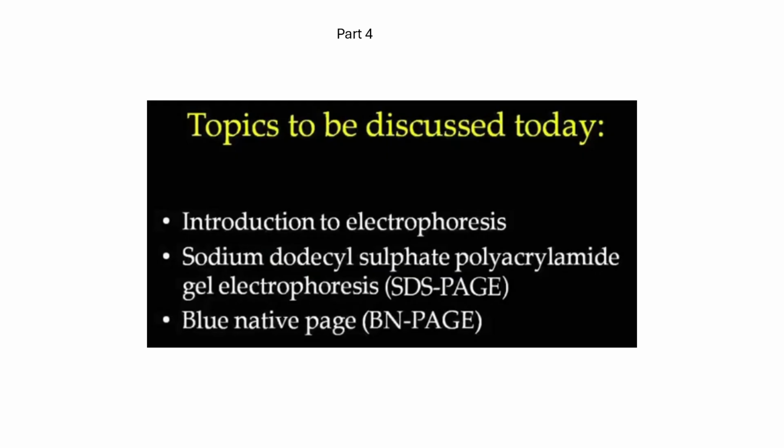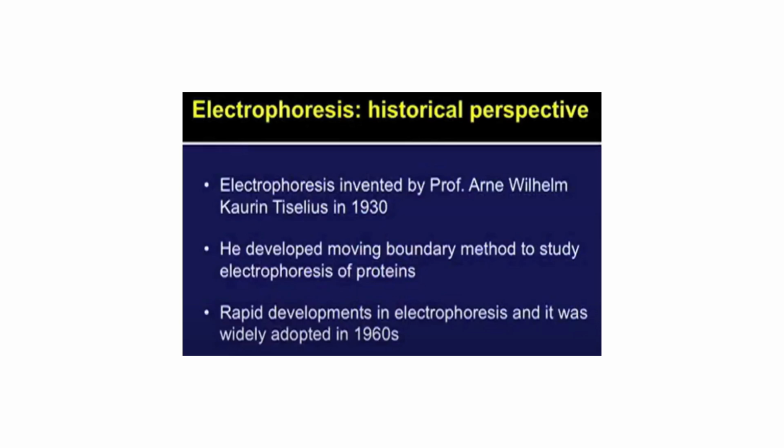Then you cannot degrade it. And if you want to, after degradation, it will have certain fragments, right? Those fragments can be analyzed with the help of SDS page. Or else, if your protein is only linear, has a single fragment and is not a complex protein, then you can directly do SDS page and check whether your protein of interest is present or not.